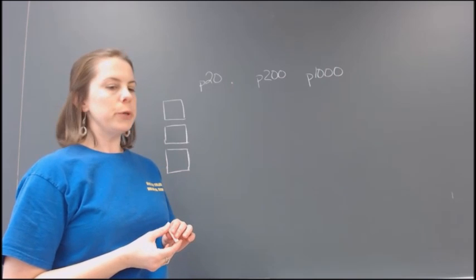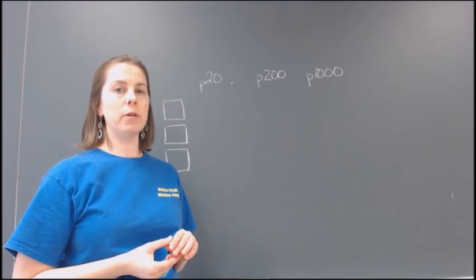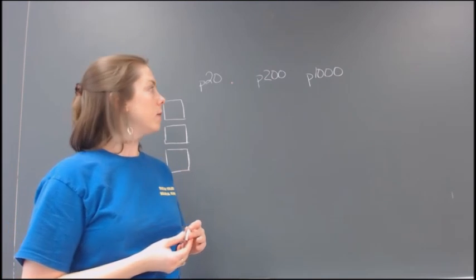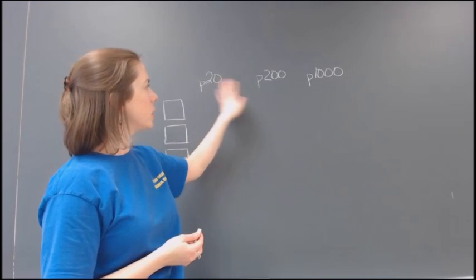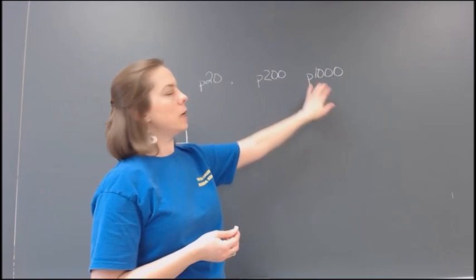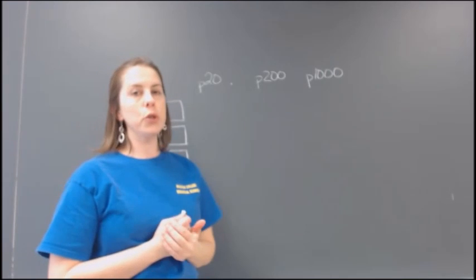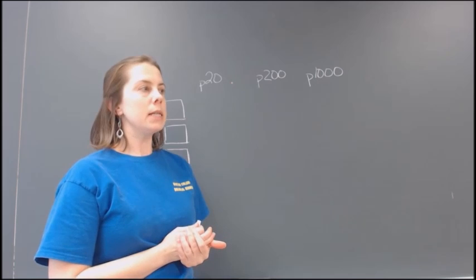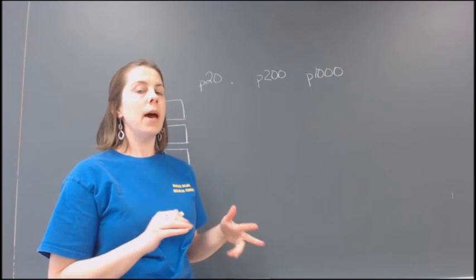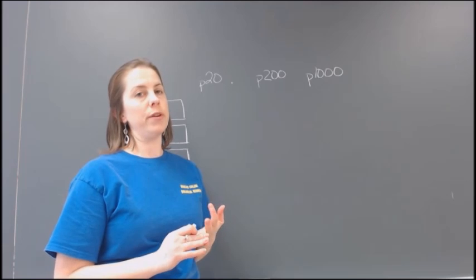We're going to review how to use pipettes to measure different volumes when you're doing an experiment. The three types of micropipettors we'll be talking about are a P20, a P200, and a P1000. Some of the most important things to know before you start to measure a volume out are how to choose a pipette, how to set the pipette, and then how to use it correctly to measure the appropriate volume.